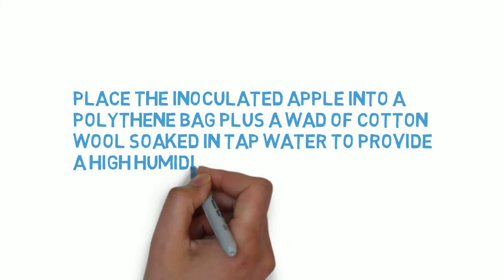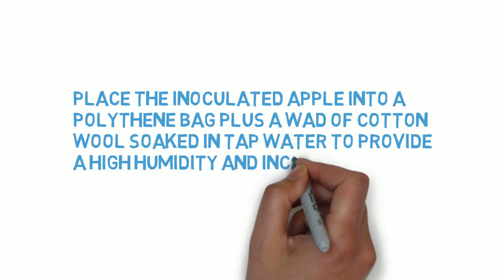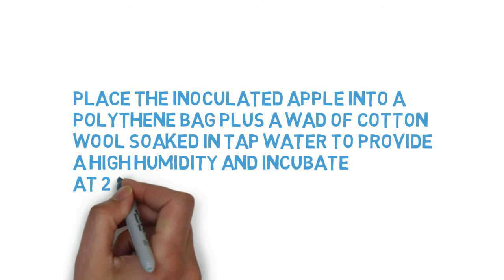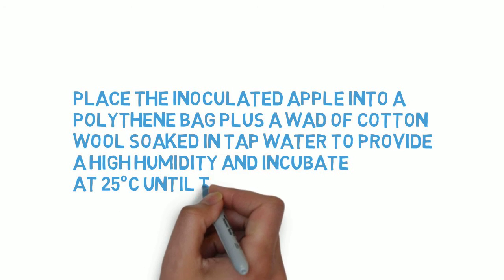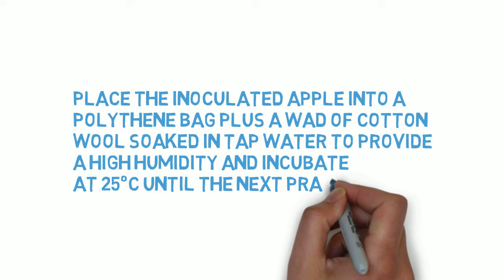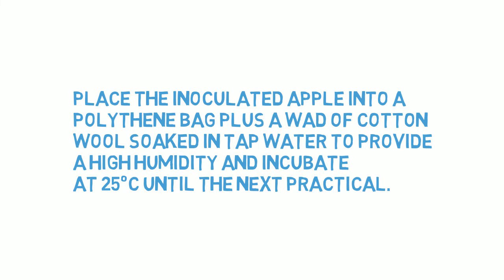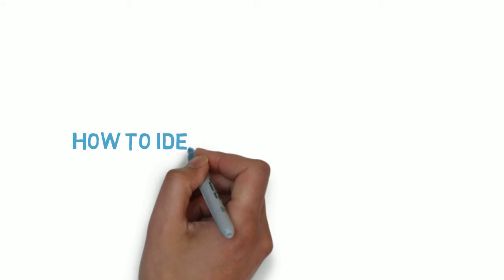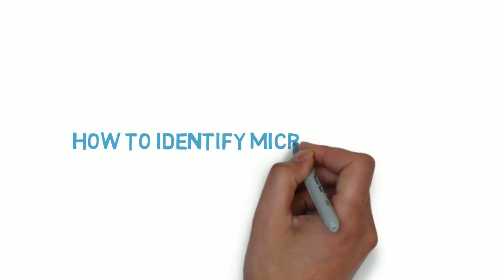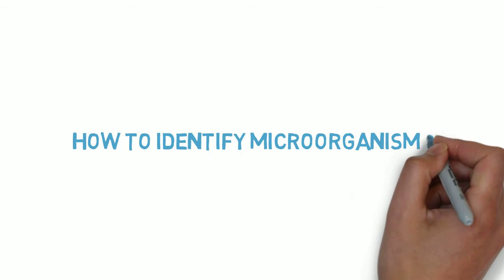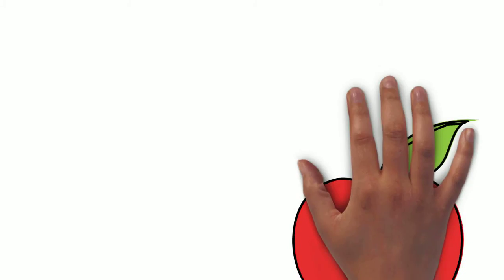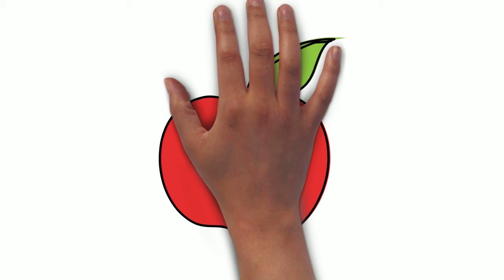In order to meet Koch's first postulate, Penicillium expansum must show signs of rot and be present in the growth. Once your apple has exhibited some rot, you will need to identify the microorganisms causing the growth. There are two main methods to do this.